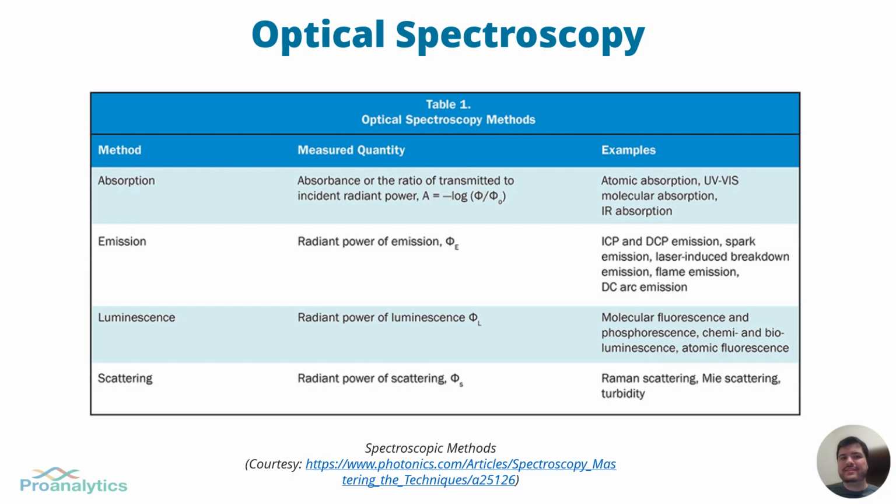All right. So let's start the webinar with explaining what optical spectroscopy is and the physics behind Raman spectroscopy. First of all, optical spectroscopy is a subset of spectroscopy and is often employed as an analysis technique to measure the interactions of different wavelengths of light with matter to determine the physical and chemical properties of the sample with which the light is interacted.